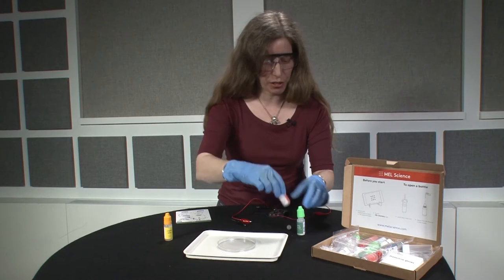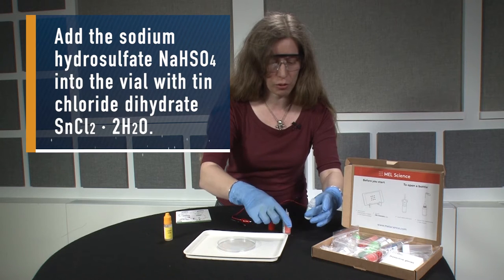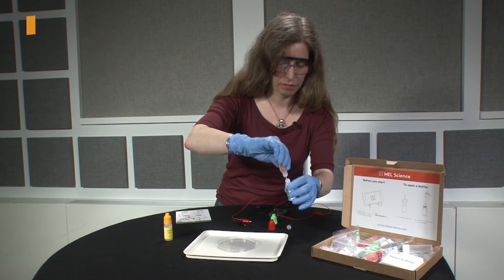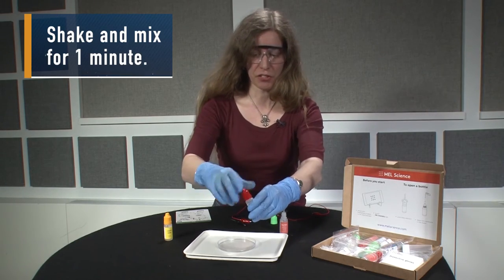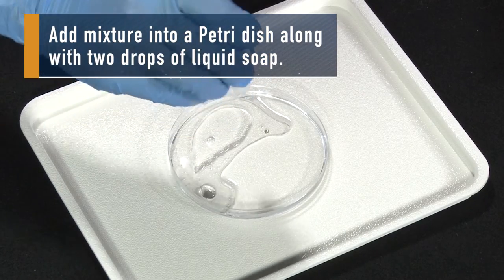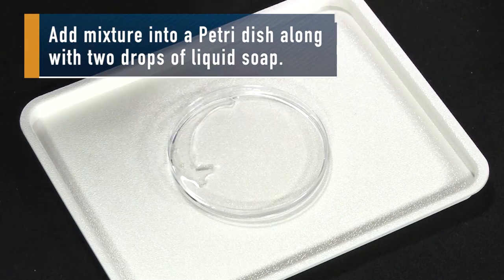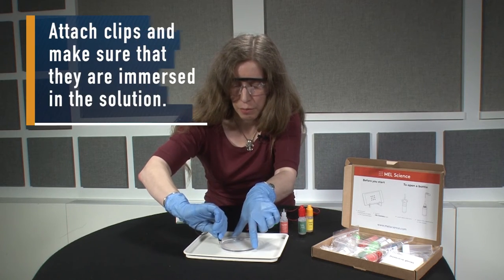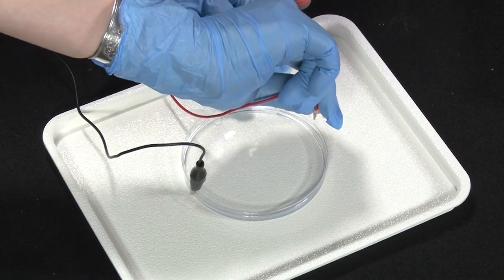First, we're going to take the sodium hydrogen sulfate and add that to the tin chloride. Once this is mixed, we add it to the dish. Then we add a couple of drops of liquid soap — just two drops. Then we add the current by attaching these clips so that the metal is in the solution.